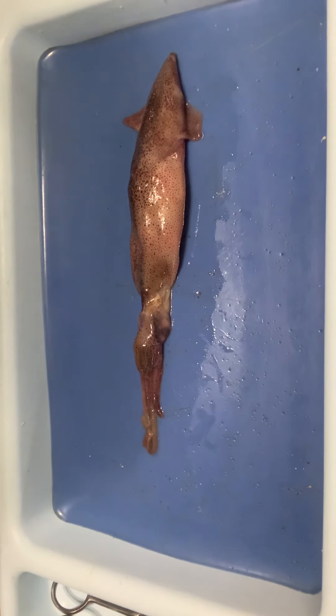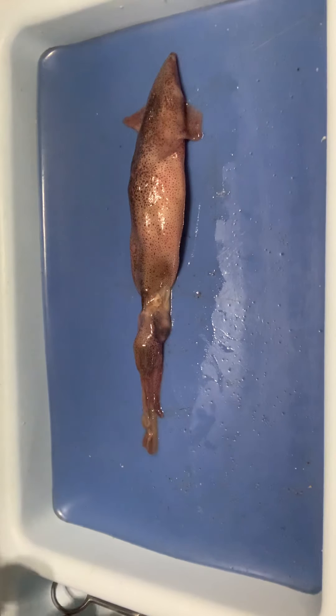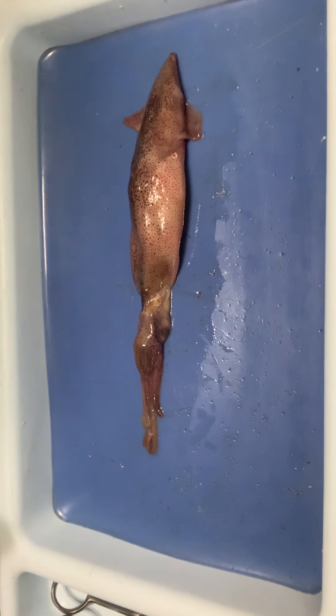Let's look at the external anatomy of a squid. The first thing we want to do is orient ourselves, looking at the body plans of these guys. Remember, cephalopoda means 'head foot.' They have a very unique body plan, and we're going to take a look at the anterior, posterior, dorsal, and ventral orientations first.